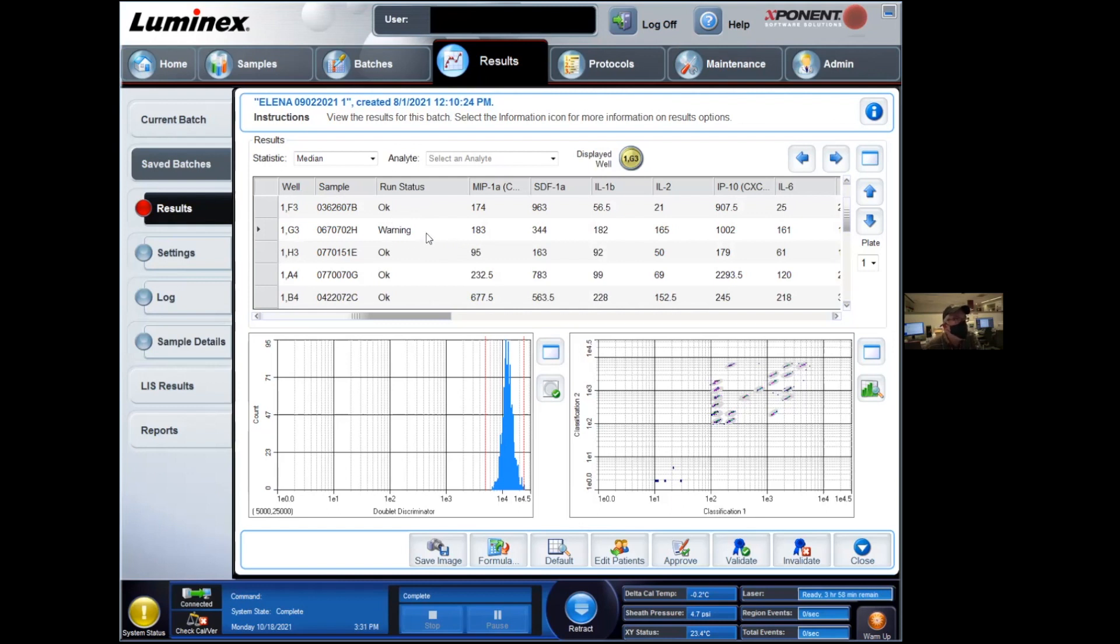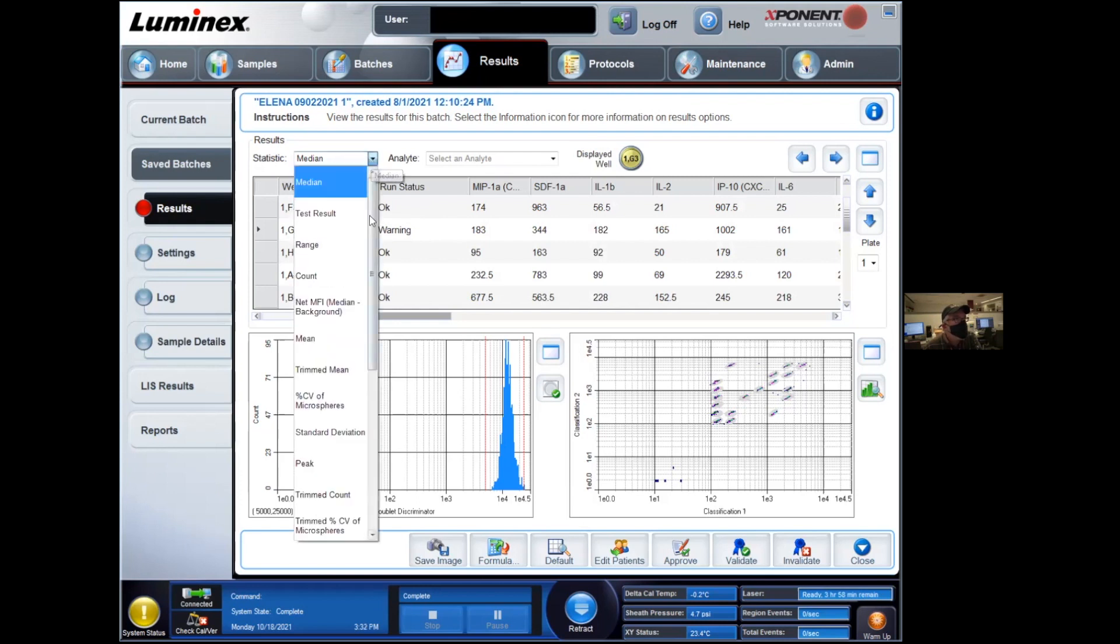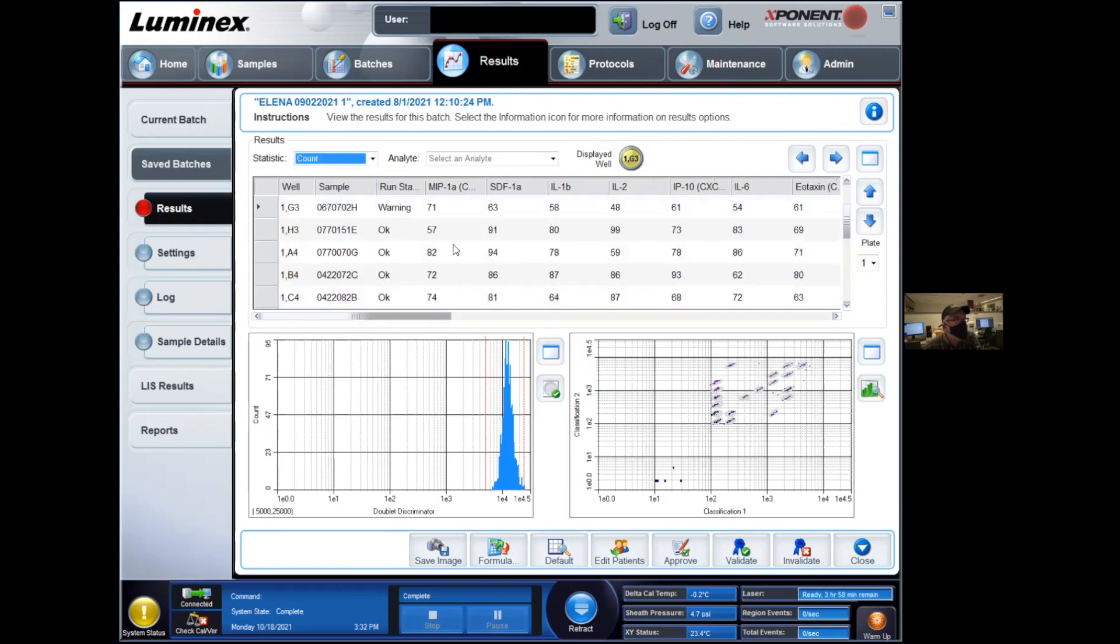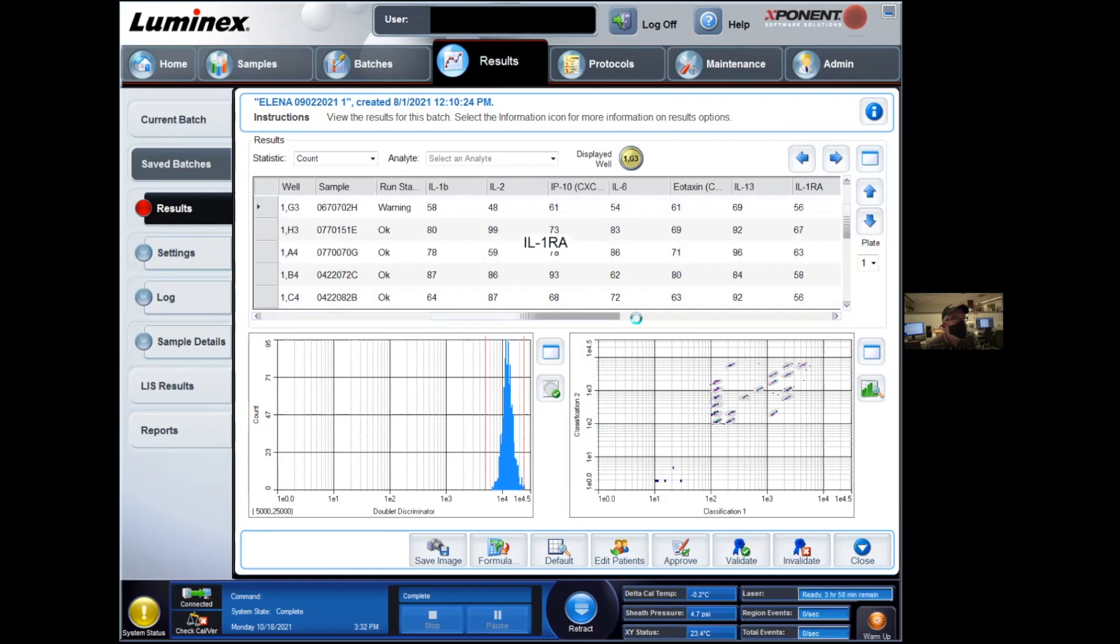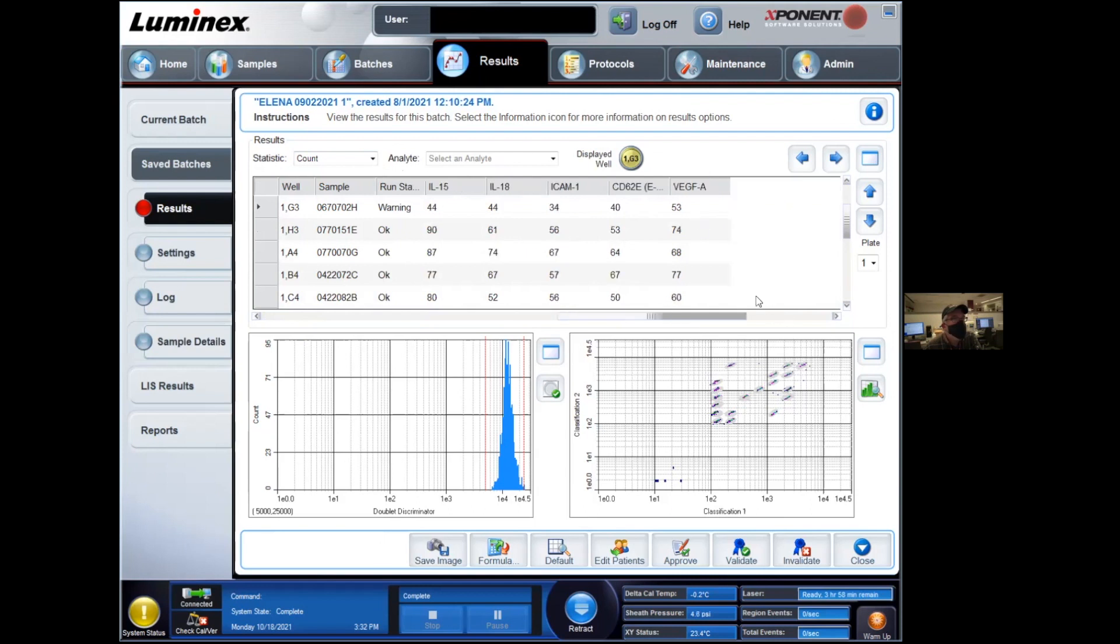And one way to make sure is simply to go to the statistics box here and select the count. So count actually tells us how many beads were counted. And I can see here, I have a 48, maybe I have other issues down the line, 49, 44. So in this case, some of these wells, some of these analytes, we didn't count enough events for the whole acquisition. And after the time lapse, the instrument just moved on to the next well.